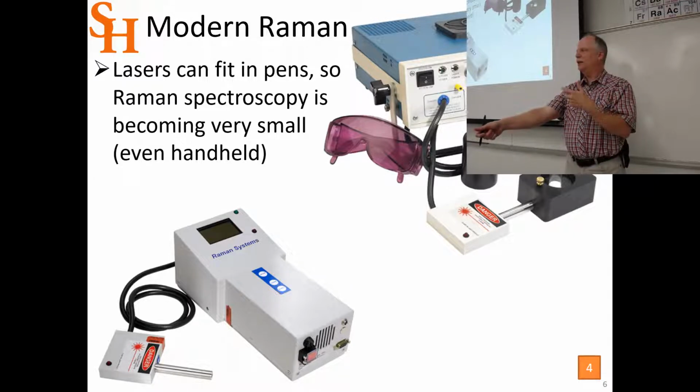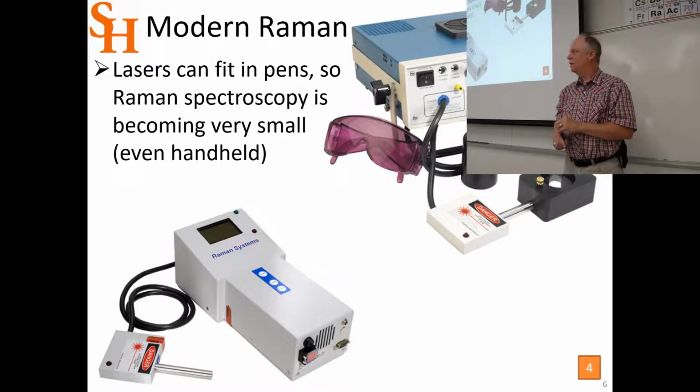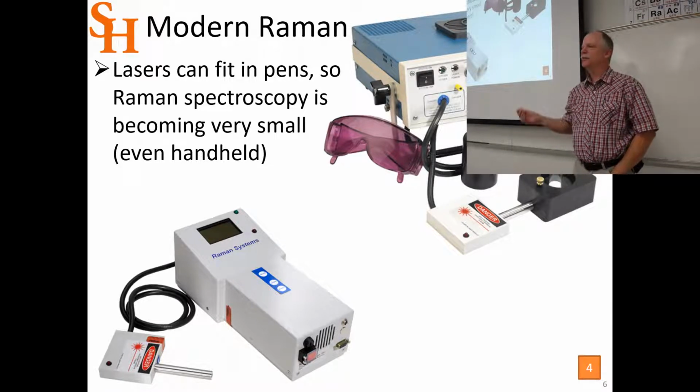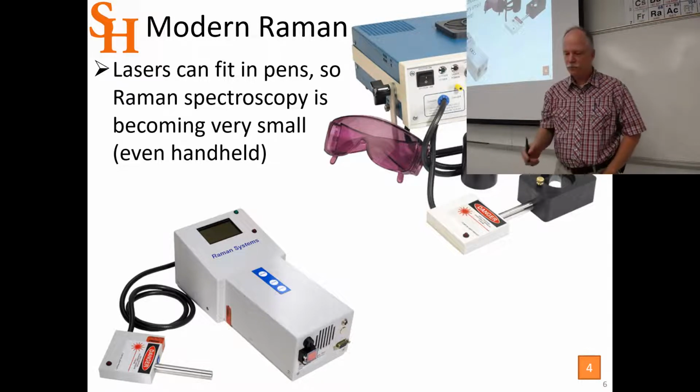If it wasn't in the library, then you should have some sort of quality check that says unknown, so it doesn't just pick the one that's closest. And so you would, in that case, be getting a lot of false positives. And so this is a pretty easy field technique now. These things can be battery powered.